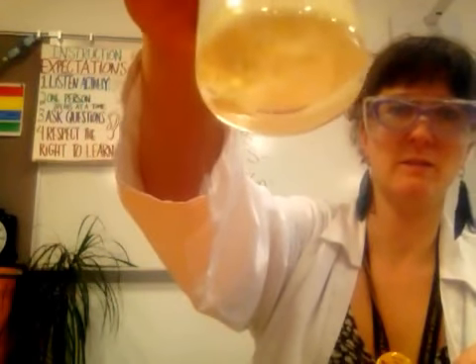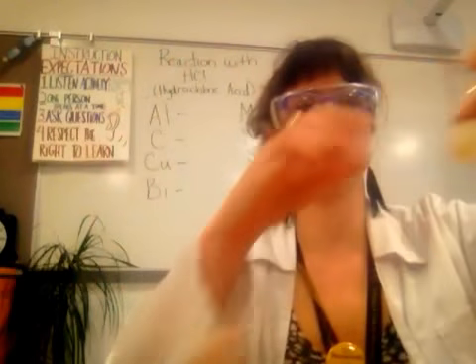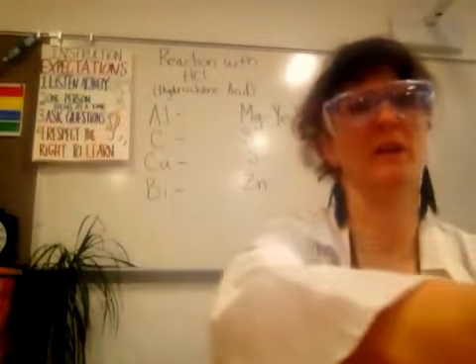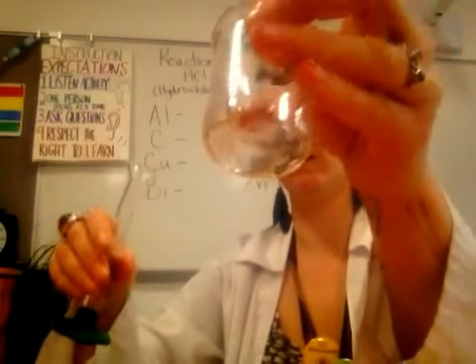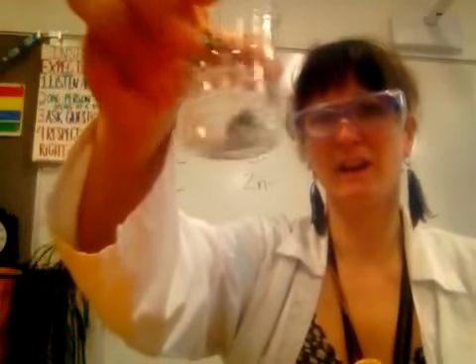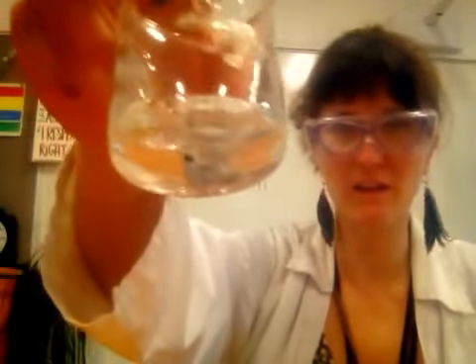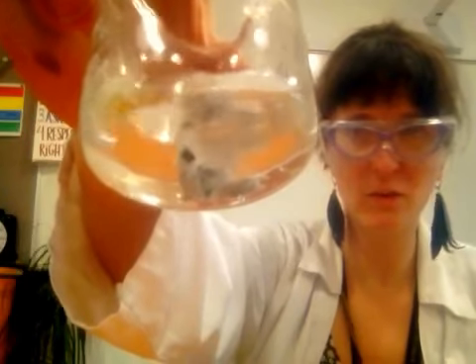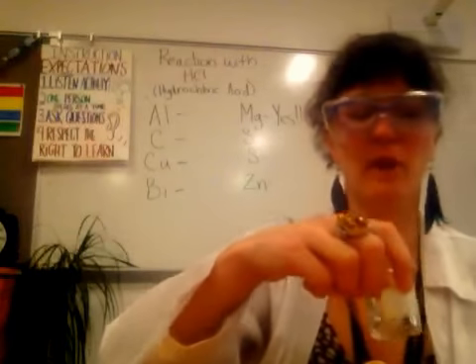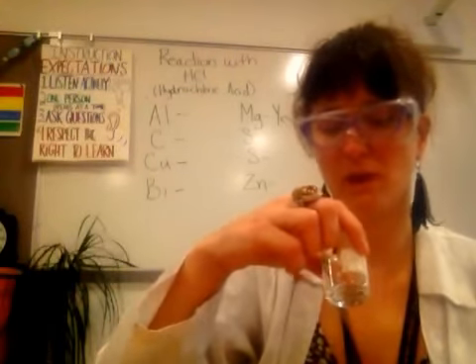It's acting very similar to the way that it did with the copper 2 chloride. With the copper 2 chloride, there was no reaction, so far at least. And then I've got the zinc, our last one here. So I'm going to add that hydrochloric acid. Oh, excuse the bell. All right, so this right here is the zinc. If you look really carefully, you can see that there are small little bubbles forming on there. So I'm going to come back very briefly, kind of show you what we've got going on.